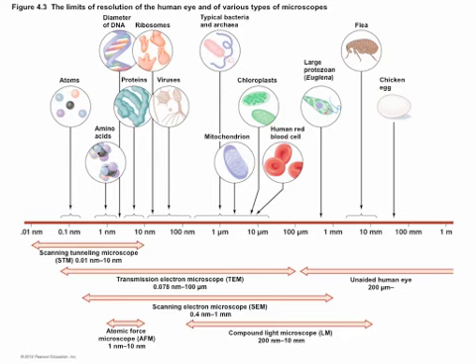And there's a reason for this, and that reason is that with light microscopes, you're looking at light. A lot of you might not have thought about this in the past, but light has a size. Visible light runs from about 400 nanometers up to 600 or 700 nanometers. I don't remember off the top of my head, but it's in that range of about half a micron. The smallest light that you can see is about half a micron.